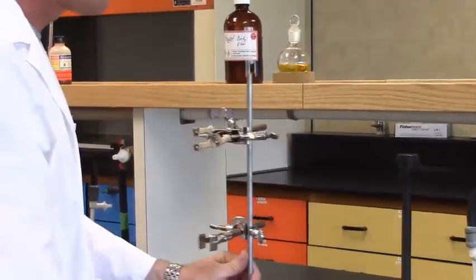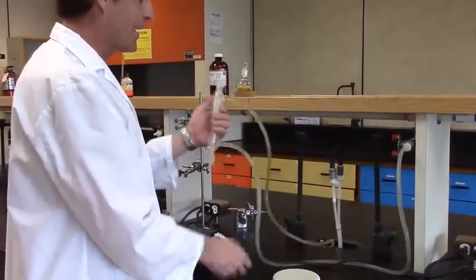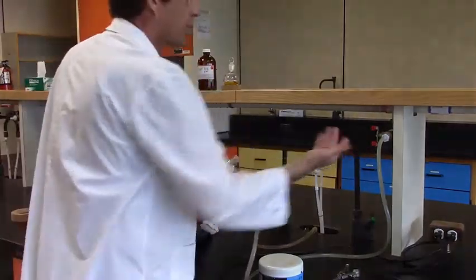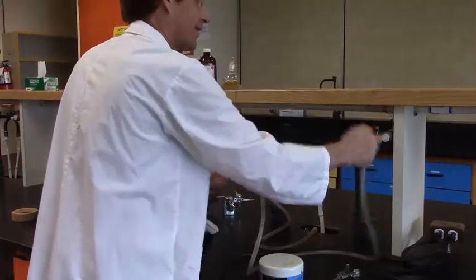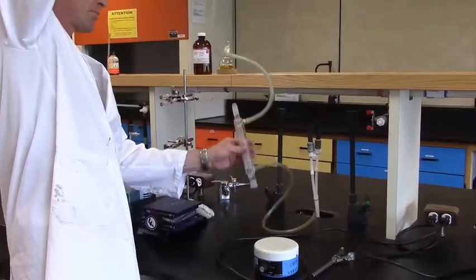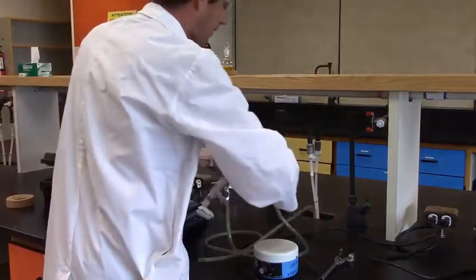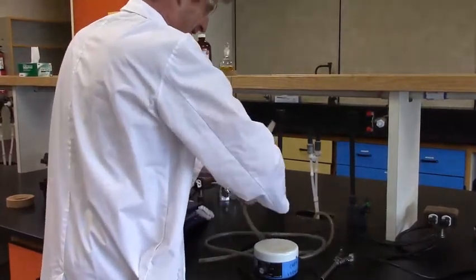The most complicated part of this whole setup is how to get water out of the condenser without getting water all over the table. First ensure the water is off, then disconnect at the spigot — the water source — and hold that hose up vertically. When held vertically, the water drains quite naturally by gravity. Water's out of the condenser, and the hose comes off — sometimes they're a little snug.